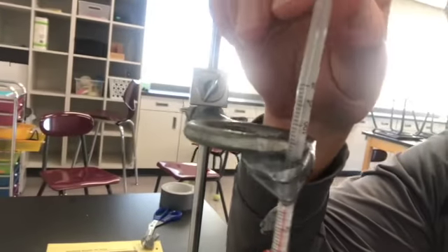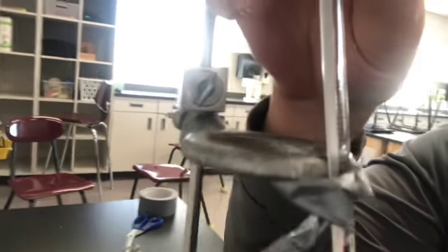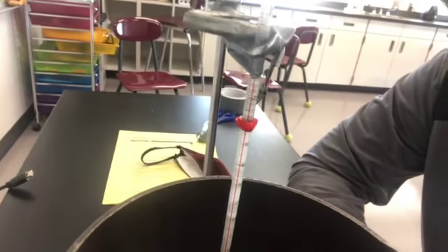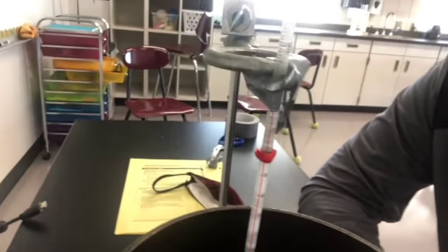If we take a look at our temperature, I don't know if you can see it, it's at 90 degrees Celsius. Okay, 90 degrees Celsius. All right, let's give it about 5 more minutes and see what happens.